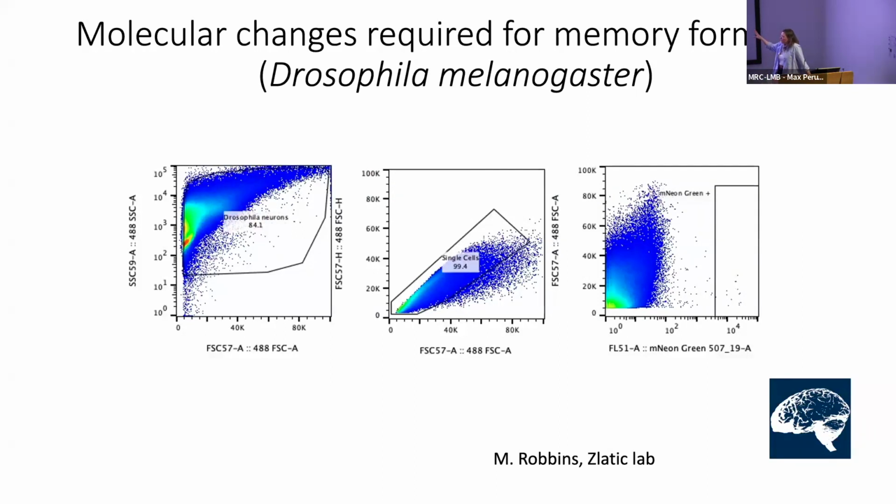So she's sending these samples off for sequencing. We should have the results very soon. But to give you context, after running the samples, the total number of cells I would get would be about 50 if I was on a good day. So I typically get 2 duplicates of 50 cells, and we sort into micro PCR tubes to make sure that we maximize the recovery as much as possible. So I'm really looking forward to seeing the results of this.